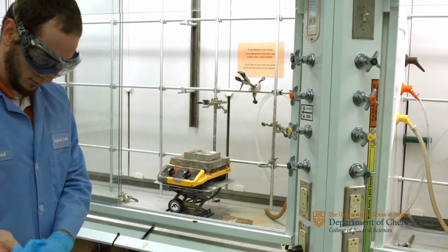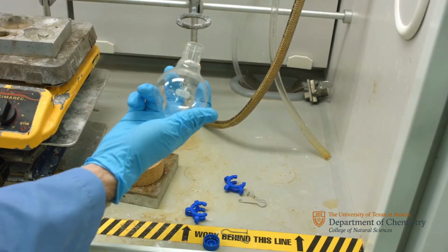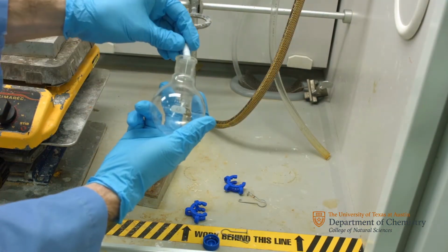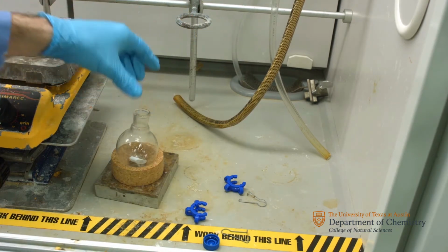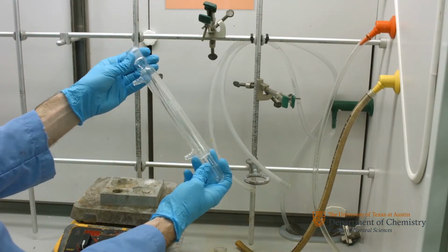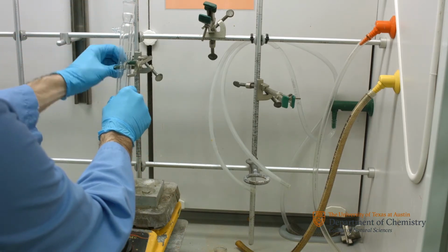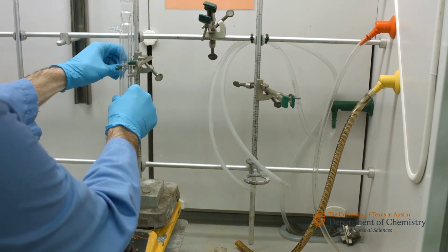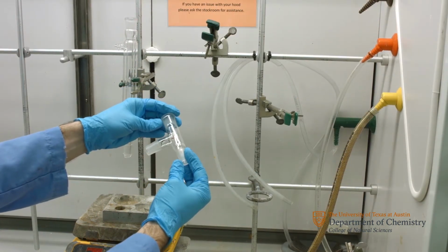To start the experiment, you must first set up the fractional distillation apparatus. First, place the 100 milliliter round bottom flask with the 1-inch stir bar onto a cork ring for later use. Attach a metal clamp to the column, trying to center it above the hot plate and/or stir plate. Next, attach the distillation head.